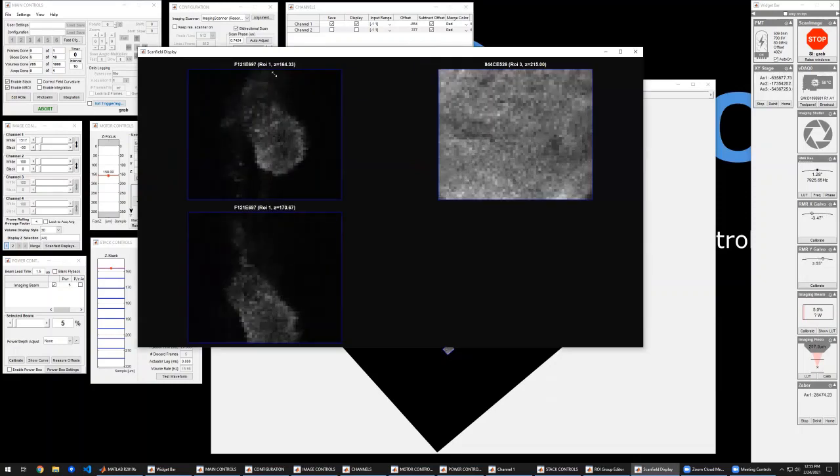So that's just a few ways that you can utilize the multiple region of interest feature. Like Bruce mentioned, Aaron Curlin used this kind of imaging technique to image entire dendritic tree structures and get upwards of 10, 15 Hertz volume rates, which is pretty great for volume imaging where normally you're limited to something much slower. So I'll go ahead and turn it back over to Bruce at this point. And of course, if anybody has any questions, feel free to jump in right now.